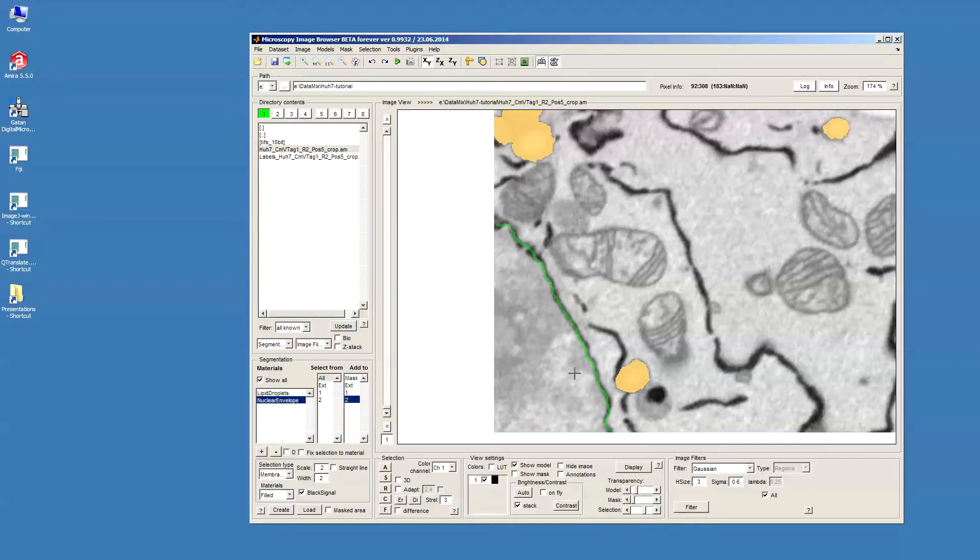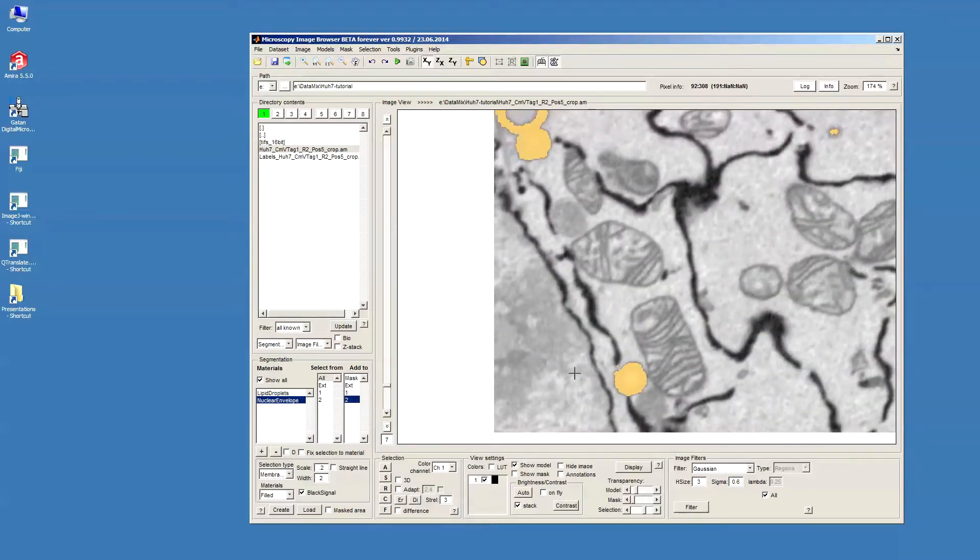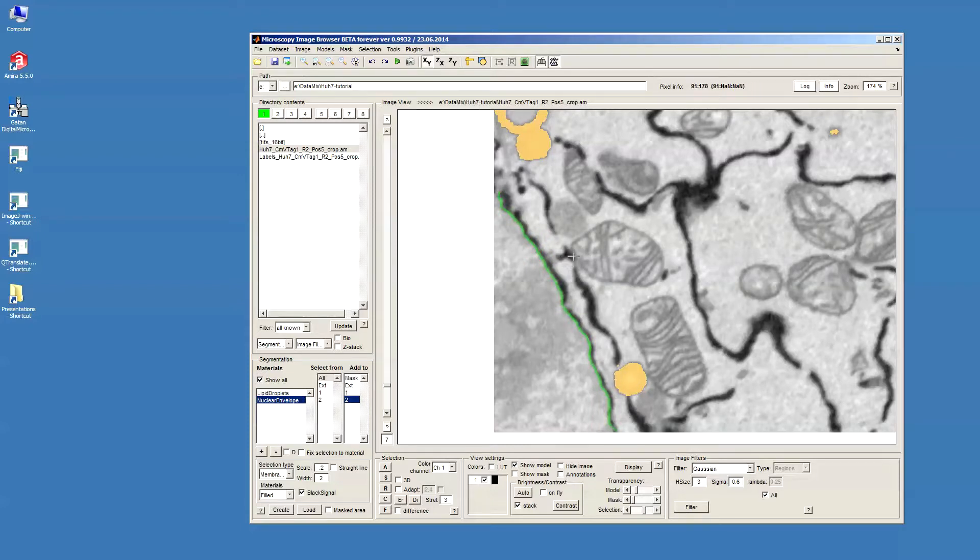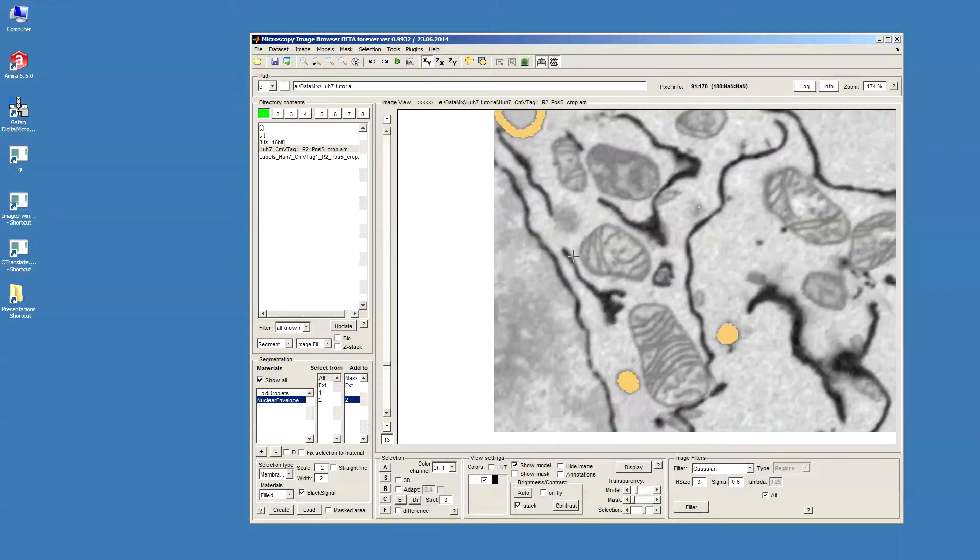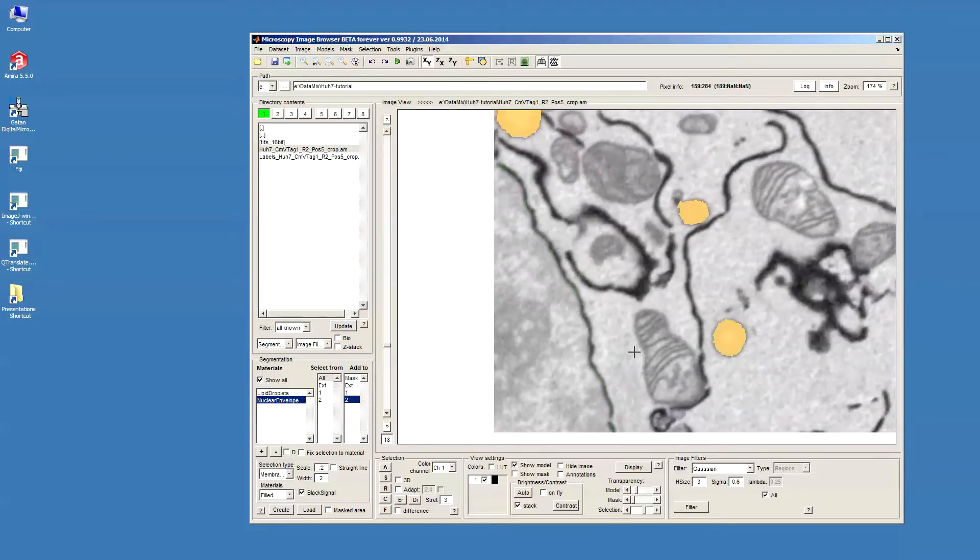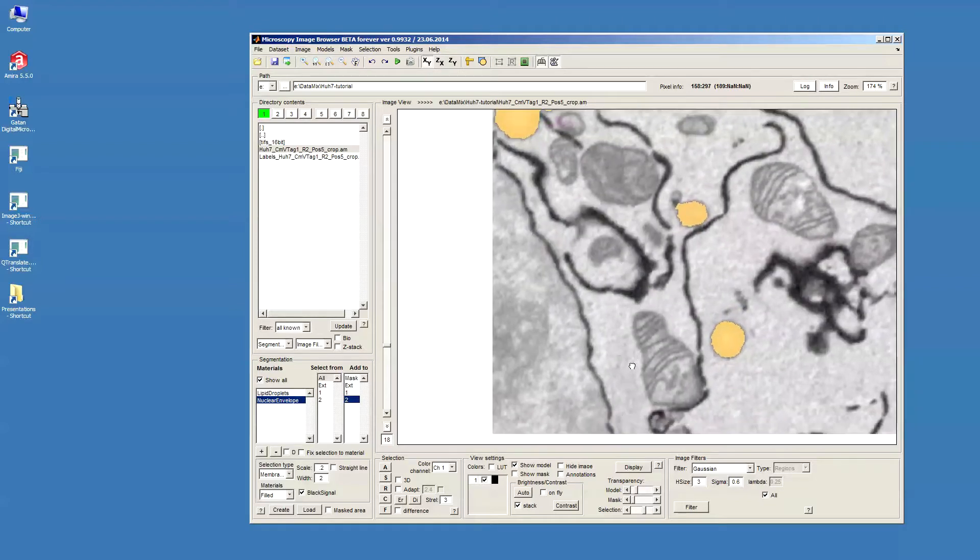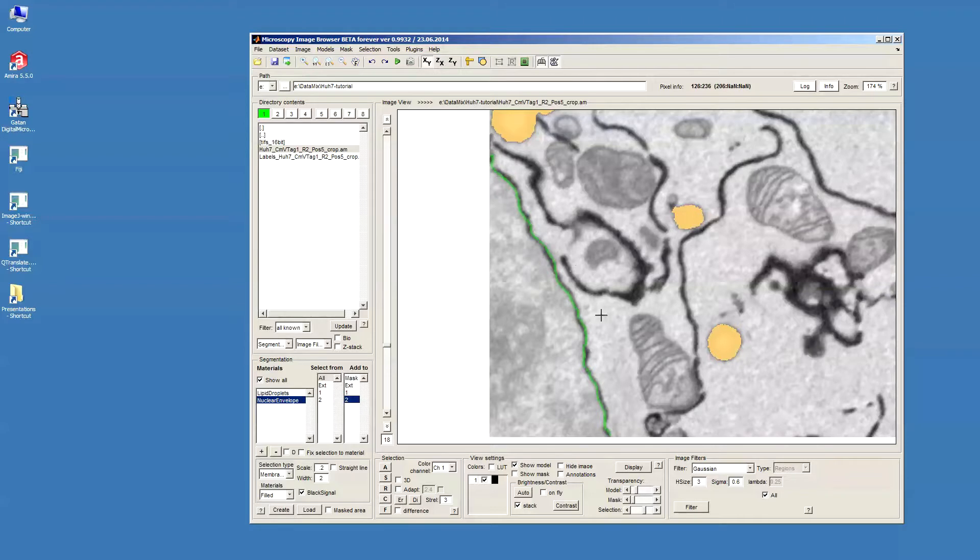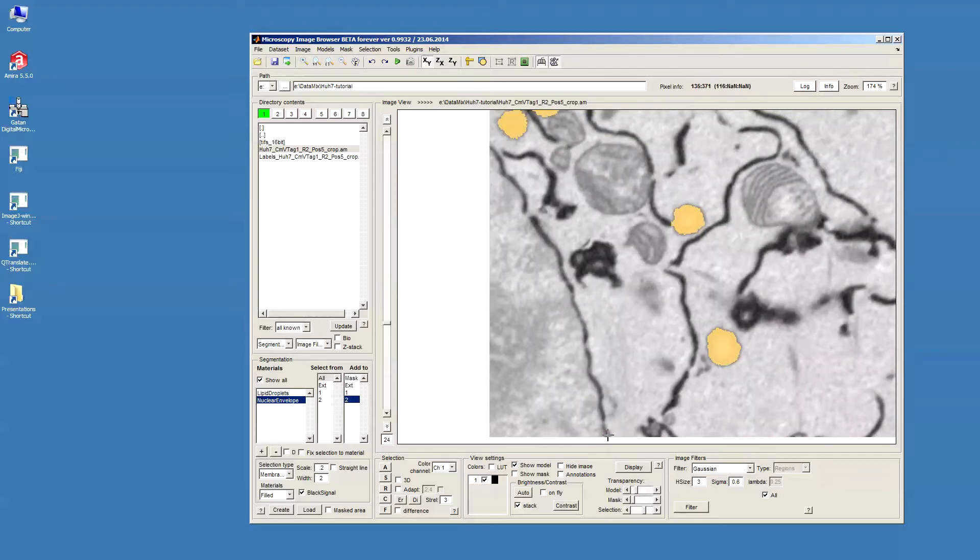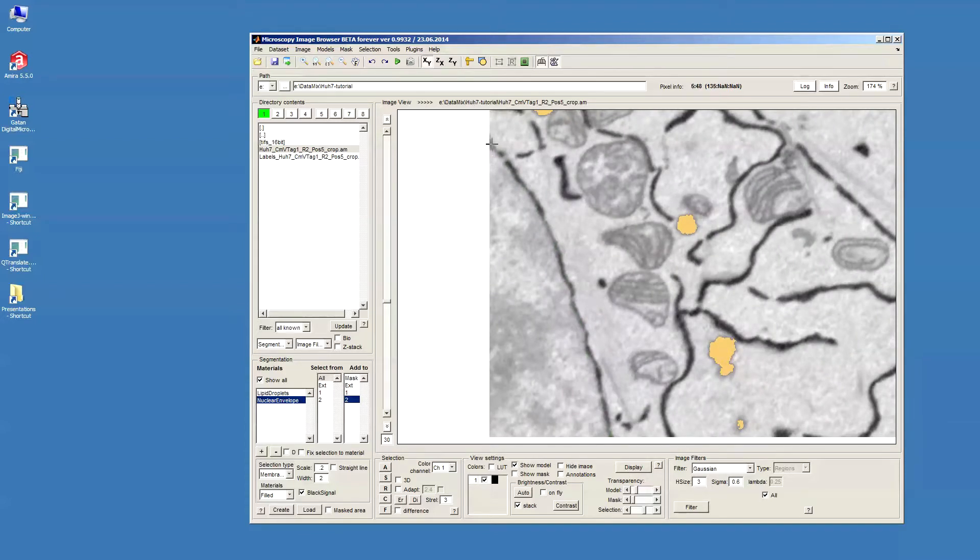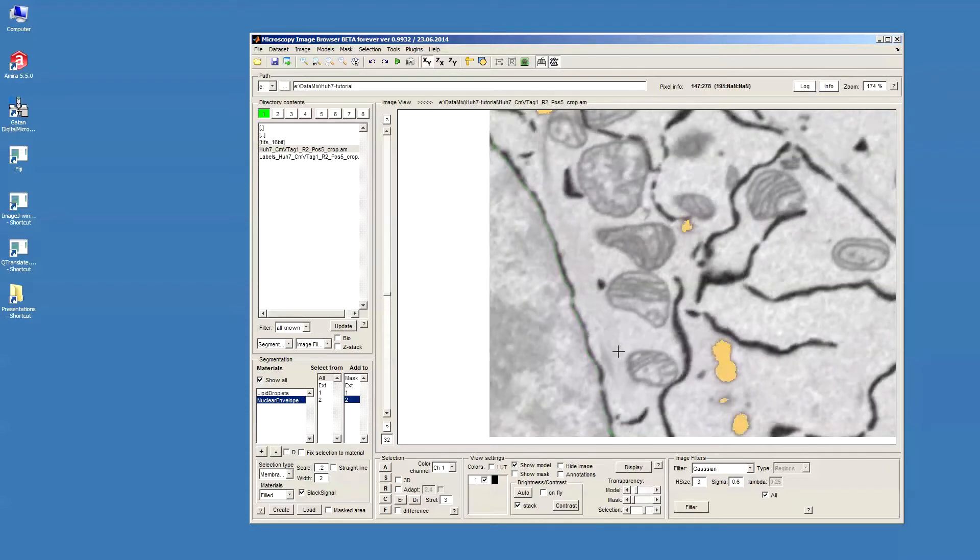Then I go a few slices further and I repeat the same. I use the Shift-Mouse-Click to define the starting point and then just a click to draw a membrane profile. Then continue further. The less steps you do in between, the more precise the model is going to be. And if the structures are changing too much, then you probably will need to place the points more frequently.